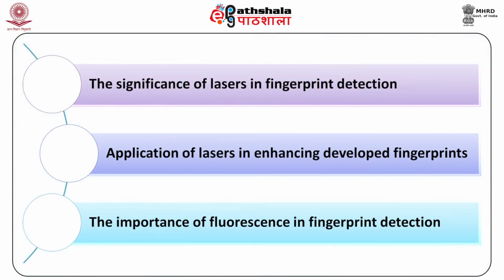After studying this module, you shall be able to know the significance of lasers in fingerprint detection. You'll learn the application of lasers in enhancing developed fingerprints, and you'll also learn the importance of fluorescence in fingerprint detection.